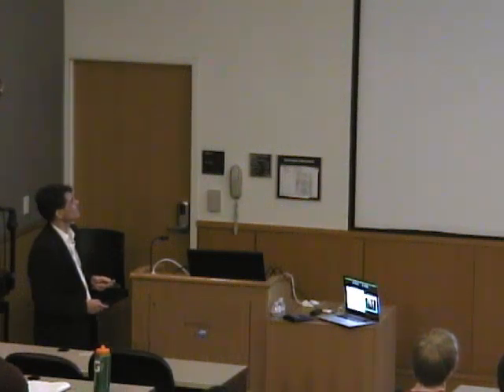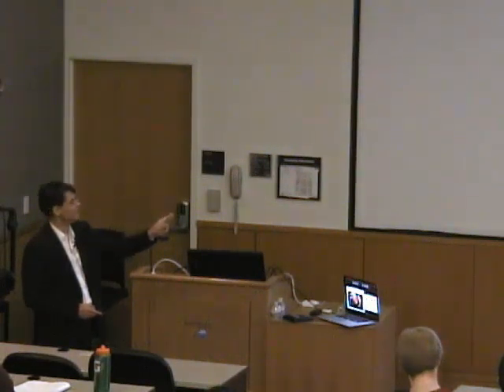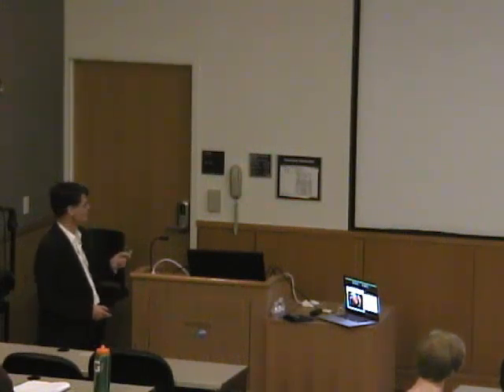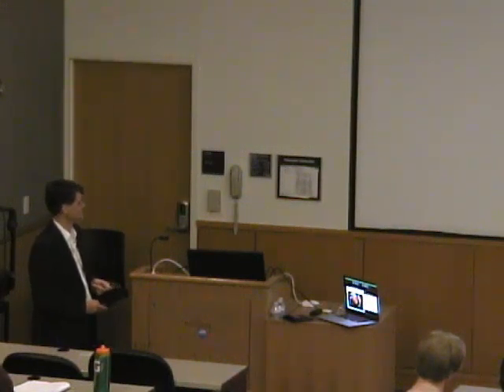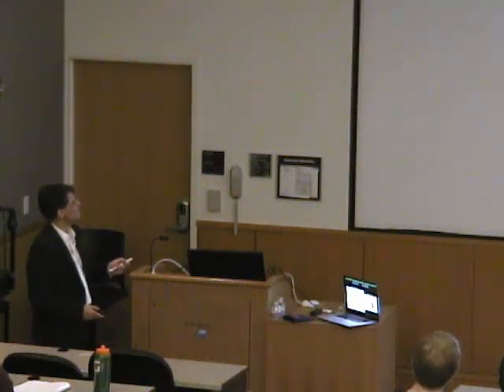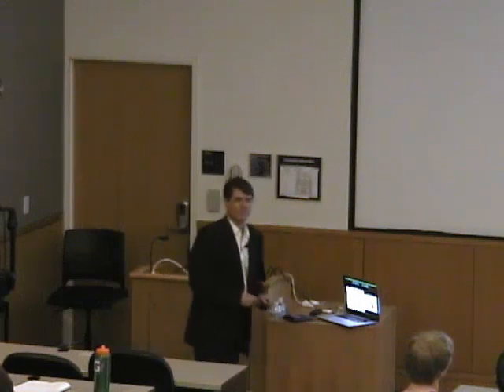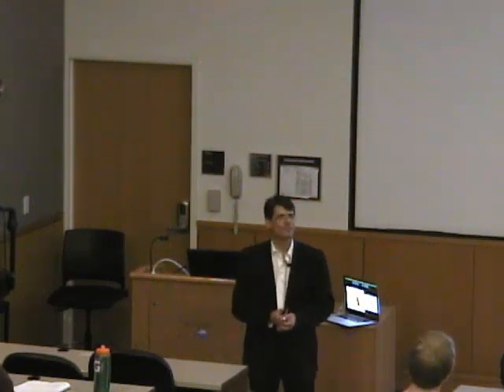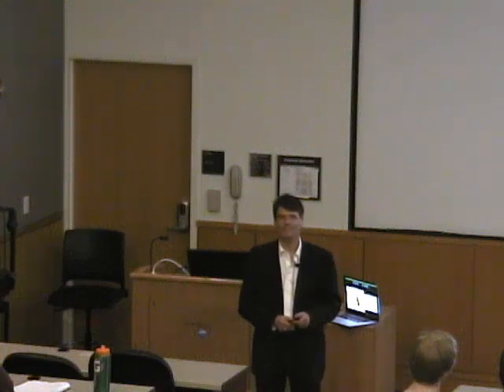Okay, so wrapping up, I very much hope that I've shown you that MCD is a really powerful technique that you can add to the arsenal of bioinorganic chemistry. I probably don't want to read all of this here again. These are all of the advantages that MCD has, all of the opportunities that it has. I've recently explained it to a friend of mine, and I want to leave you with this and happily take your questions.